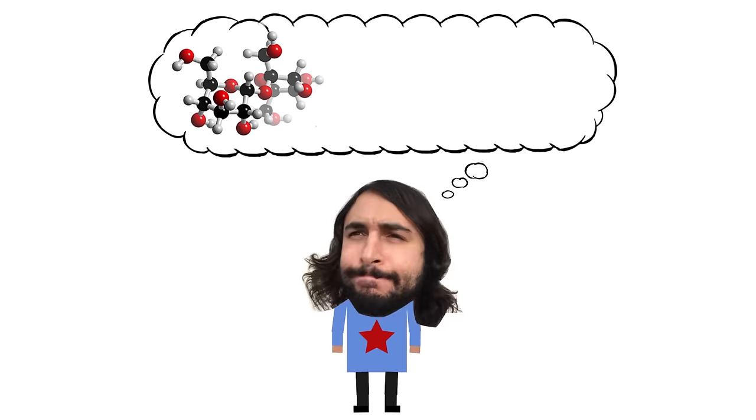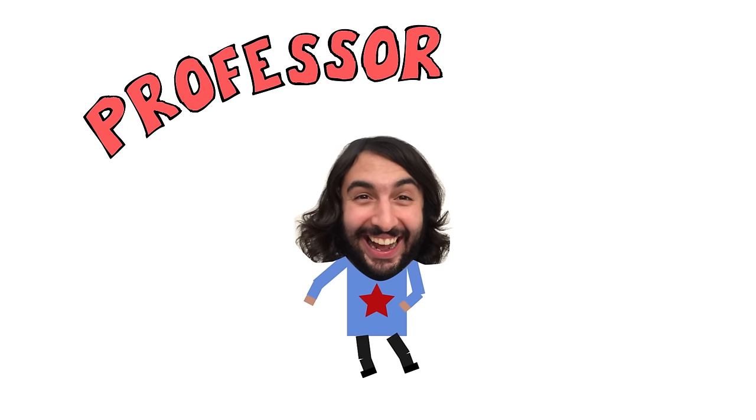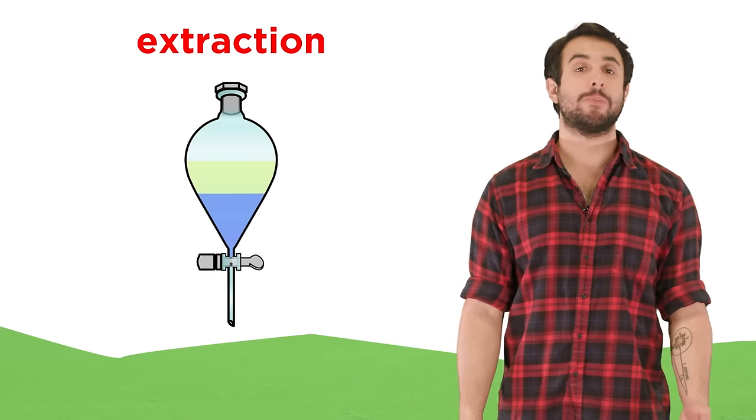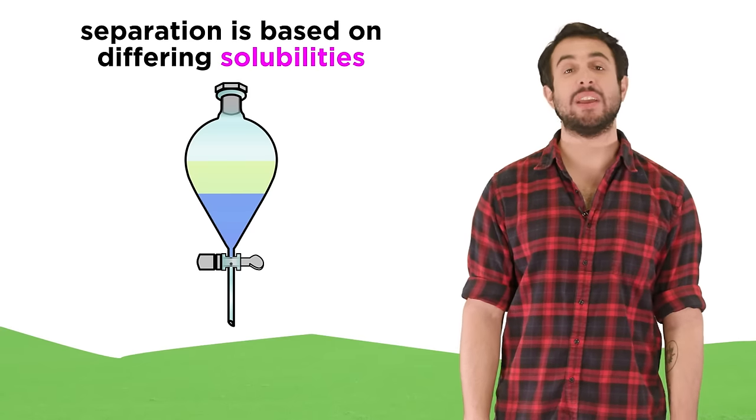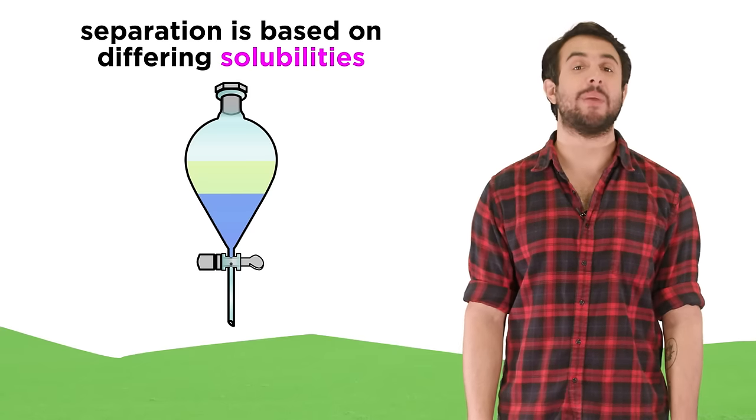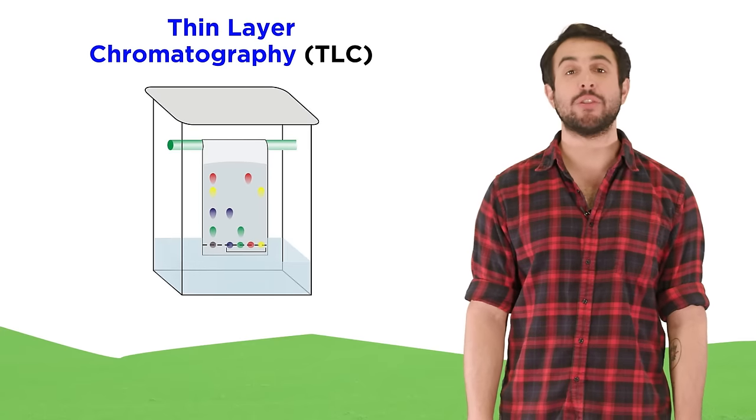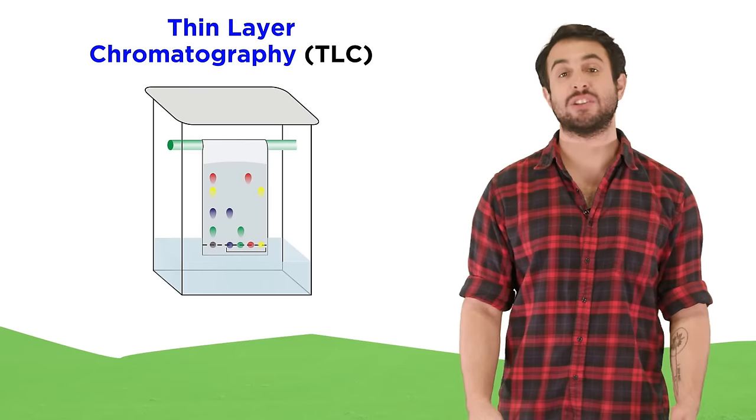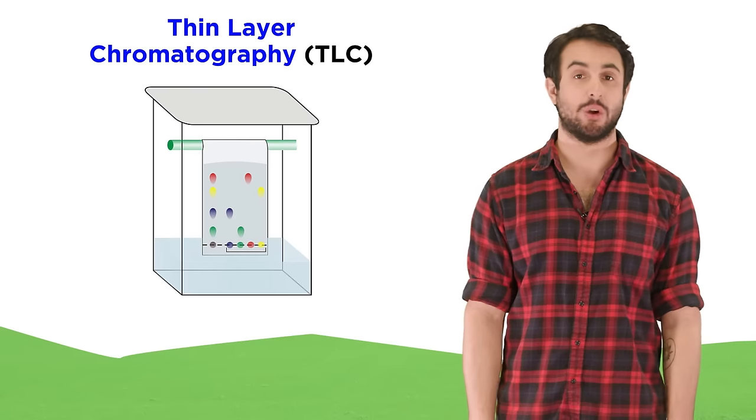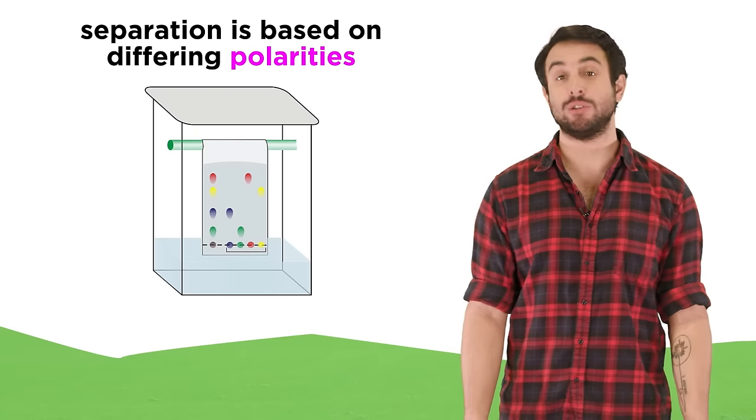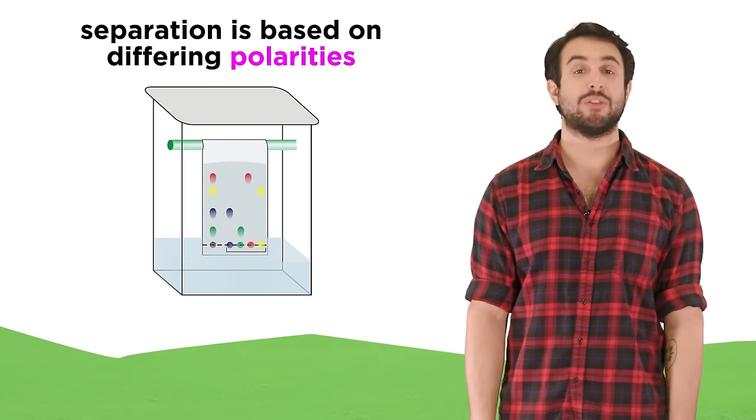Professor Dave here, let's get some TLC. We just learned about extraction, which is a technique we can use to separate compounds on the basis of differing solubilities. Now let's learn about another separation technique, called thin layer chromatography, or TLC for short. This separates compounds on the basis of differing polarity, so let's go ahead and see how this works.